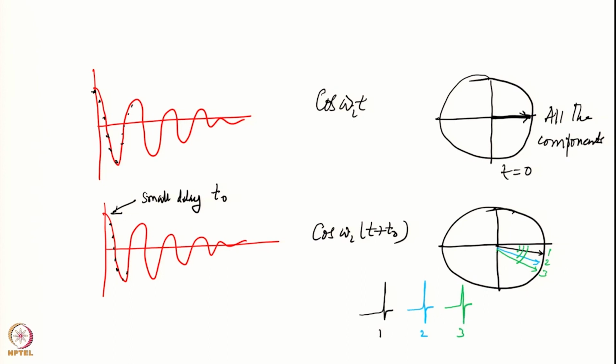So different ones will have different mixtures. Therefore this is what we call a frequency dependent phase shift.